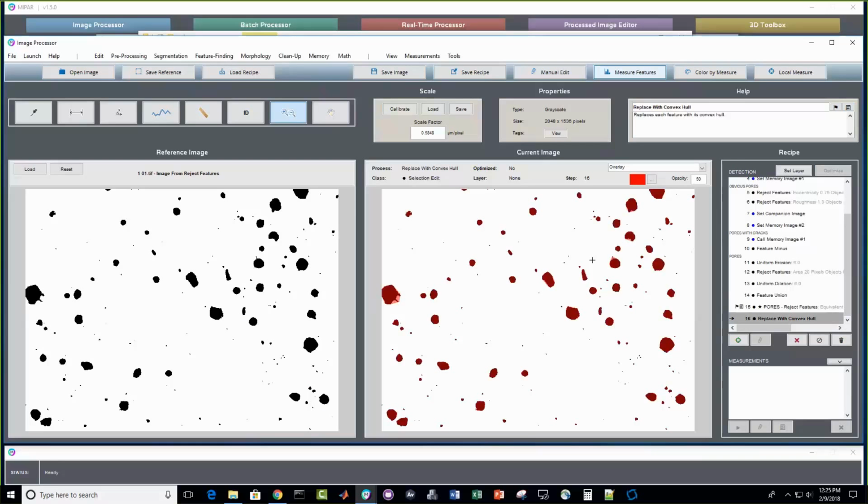It really comes down to how you've acquired the image. In that tree example, there's maybe 5 pixels per tree. For your particular purpose, that might be enough resolution on the trees if you're just interested in their location or possibly even their size. You probably can't get shape with 5 pixels per feature. Then you go to the atoms example, and with your high-resolution microscope, you may just have 5 pixels per atom in the image. It doesn't mean that we can detect atoms better than trees.